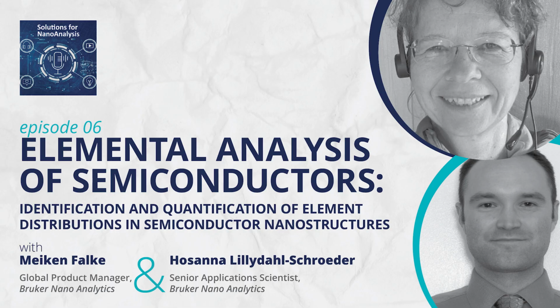And that is what doesn't come to mind immediately. Actually, one aspect is that in modern semiconducting devices, there is a surprising amount of different elements mixed together. And EDS is again useful to get an overview of all the whereabouts of these elements. And the reason is that now, and also a few 10 years ago it started, but now it's even more visible, that completely new approaches in the design of materials for semiconductor industry are needed to produce smaller and smaller stable structures. This is because just geometric scaling of the devices doesn't work anymore for future miniaturization.